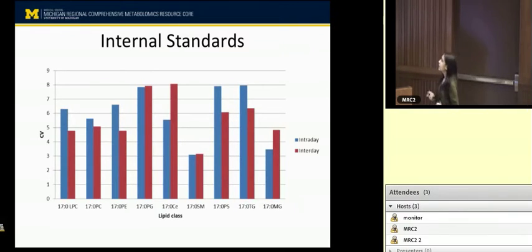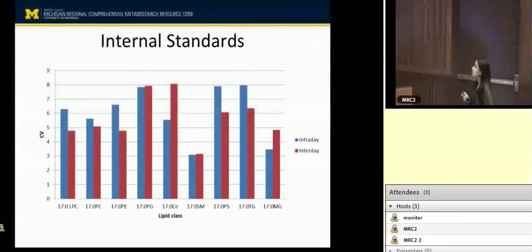There are two important types of variation that we have here. Sometimes people forget about this type of variation that can come in the data, like for biofluid type. Tissues that we get mostly are of different weights, so you need to normalize for that. And then urine samples have different concentrations, and for cell lines, it's very hard to exactly measure the exact cell count. So for these variations, you need to normalize the data, especially for tissues. We normalize by weight, and for cell lines with protein content, and for urine mostly we use creatinine.